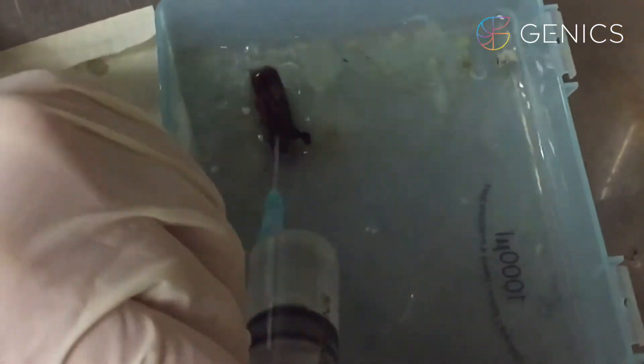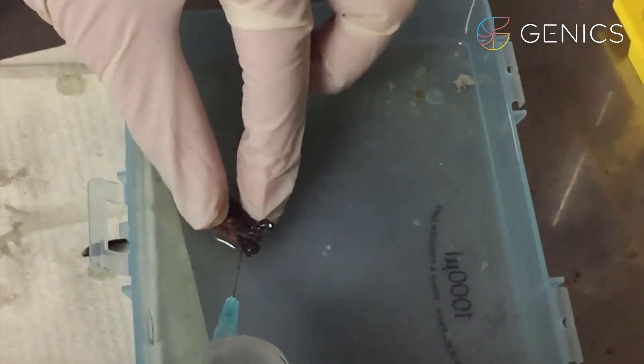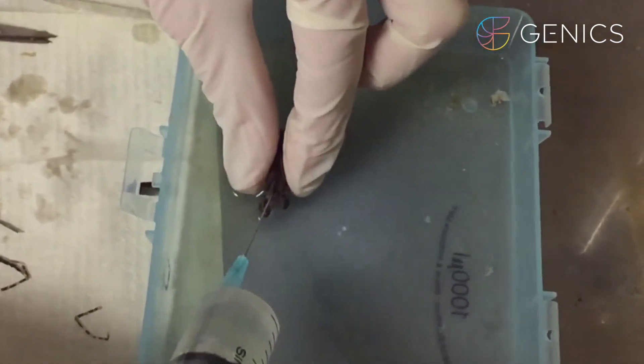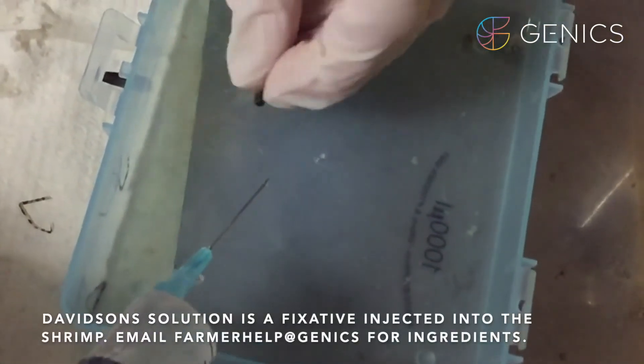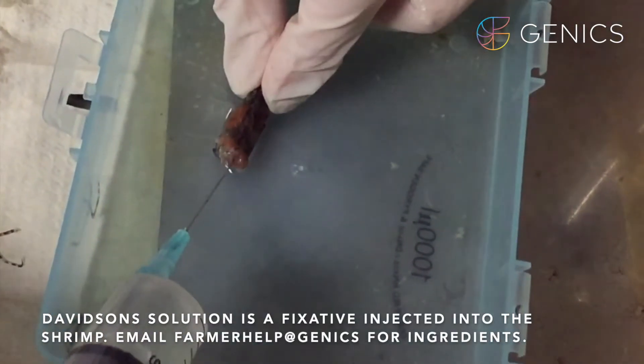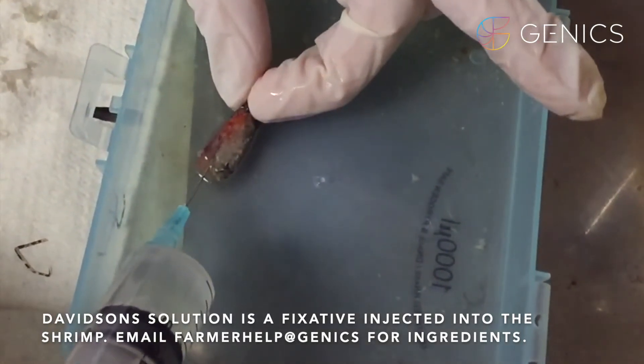Next, we're going to take the other half of our shrimp head and inject Davidson's solution into the eye sockets of the shrimp on each side. I'll then inject Davidson's solution into the hepatopancreas to ensure good fixation of all the tissues.